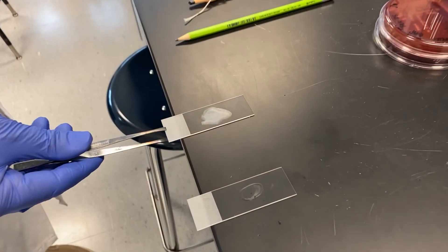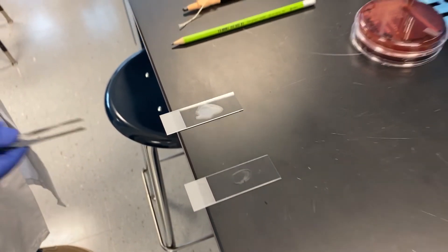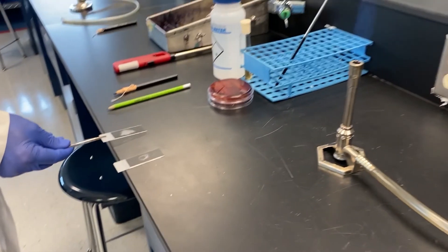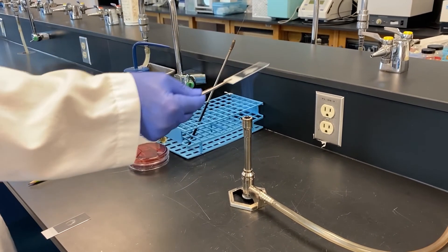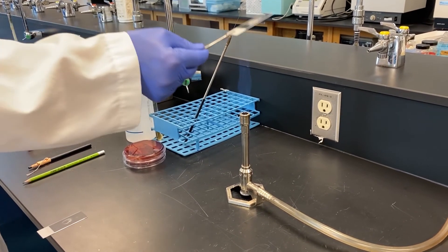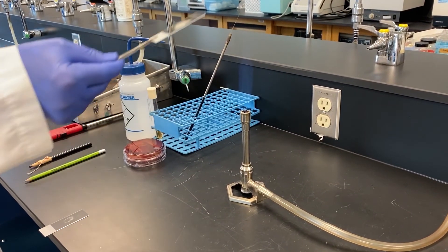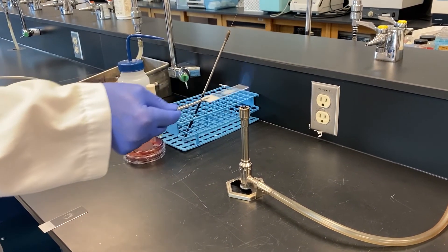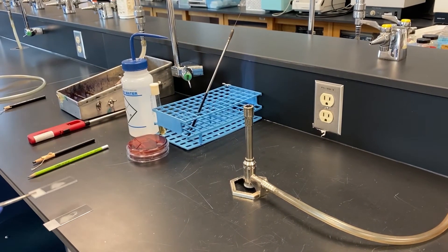We have our two smears now, one from the broth culture and one from the plate culture. We've allowed them to dry and they need to be heat fixed. Heat fixing serves to kill any viable bacteria on the slide as well as make them stick to the slide so they don't wash off during any staining procedures.